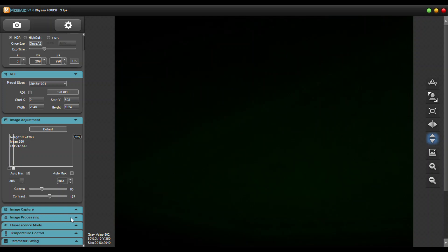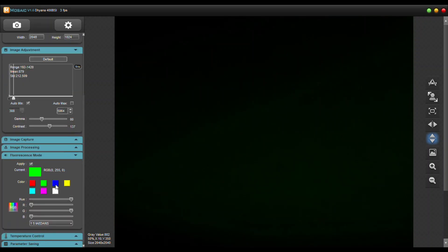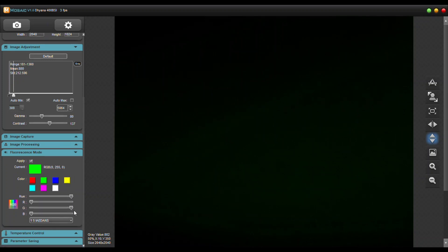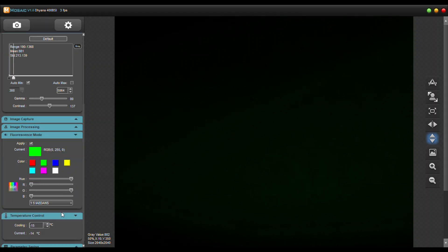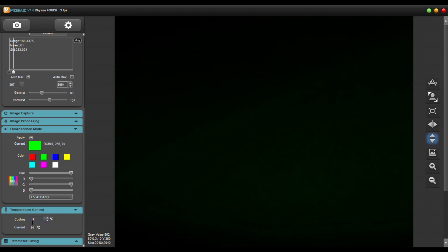You can also use fluorescent mode. In here you can actually apply pseudo colors to your slides because mainly these CMOS cameras are monochrome. So you can apply whatever color you're using for your filter. You can also control the temperature of the camera in this software as well.